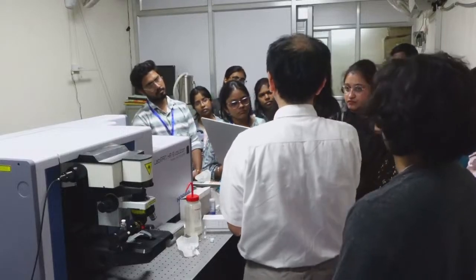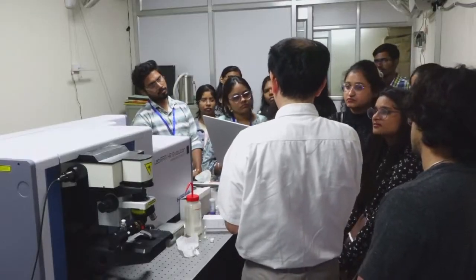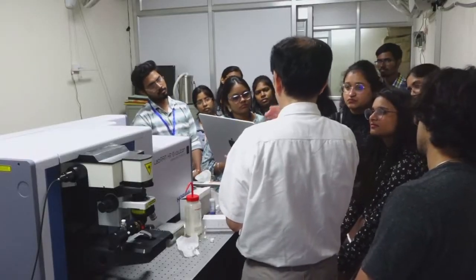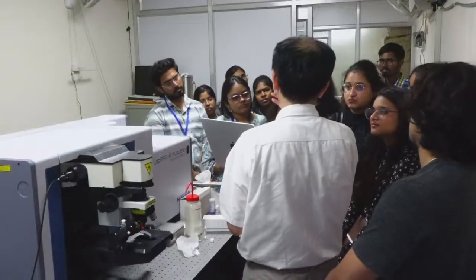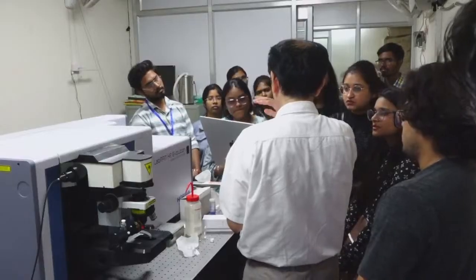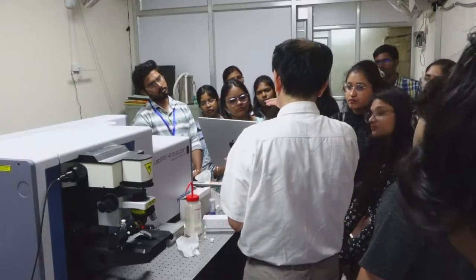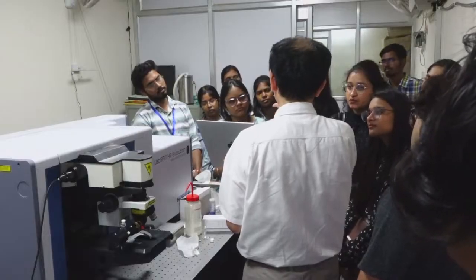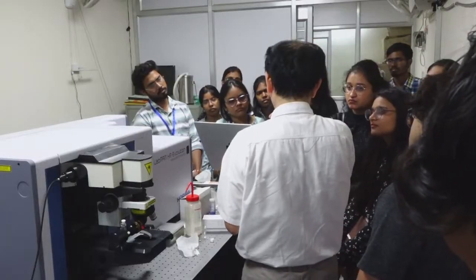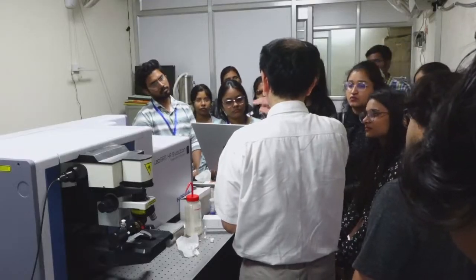So if the time is infinite, then we can increase both exposure time and accumulation number. If the time is finite, then we should increase the exposure time as long as possible and decrease the accumulation number.